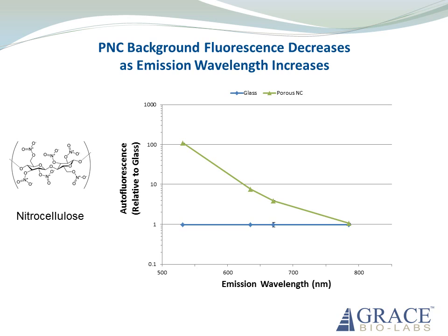It makes sense that if we can, we should label our PNC assays with a near-infrared fluorophore rather than a visible light fluorophore. In fact, digitizing scanners are now becoming available that do operate in the near IR, and in our experience, they provide superior performance to visible light scanners.